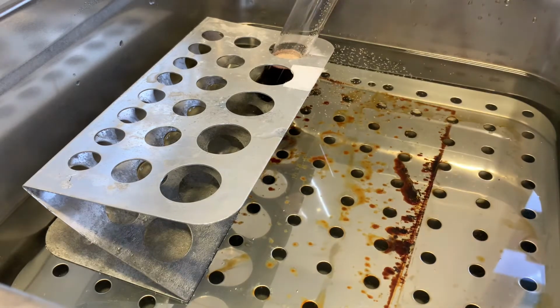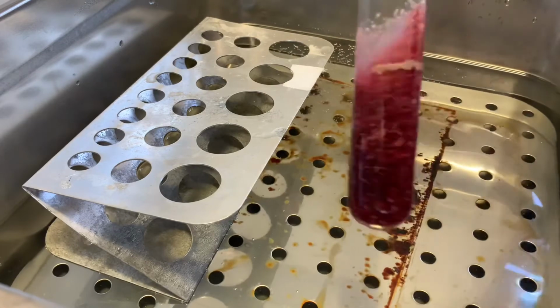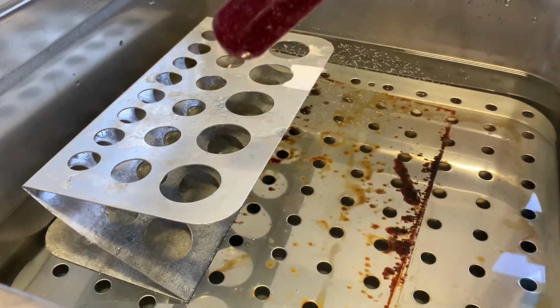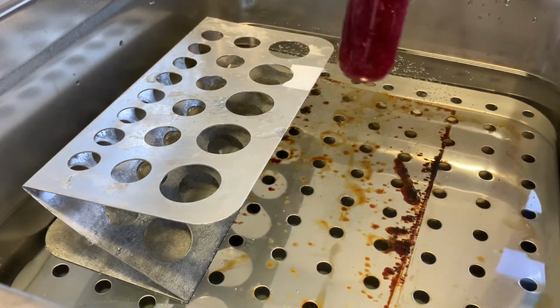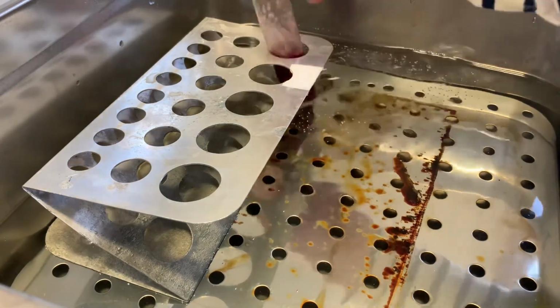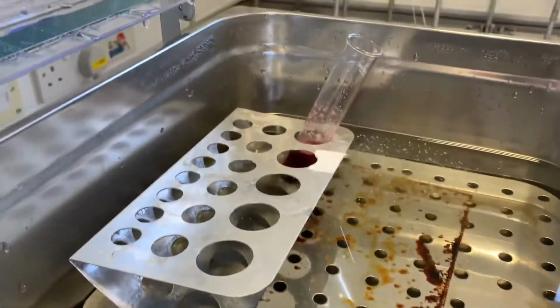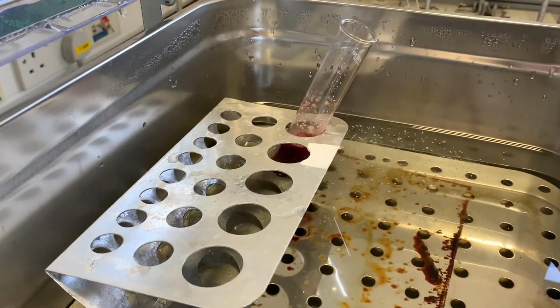So the first step is to pop the yeast in and then give it a good shake to mix it through. You can see that we've got some sitting on the top, and then what we're going to do is pop the balloon on the top, and that will give us our fermentation conditions and hopefully collect any gas that is going to be produced.